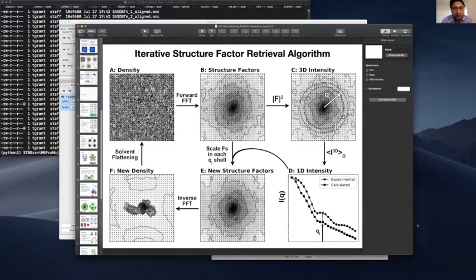Actually, I have a question regarding this DENSS model: how do you place the atomic model into the DENSS model? Yeah, we'll go through that in just a second. Actually, when we go through the tutorial with RAW, there's a whole way to do that. DENSS has some tools for doing the alignment with a PDB file or with another density map. You can do that either in Chimera or directly with DENSS. And RAW has the ability to use the DENSS alignment for a PDB file with a density map right in RAW.